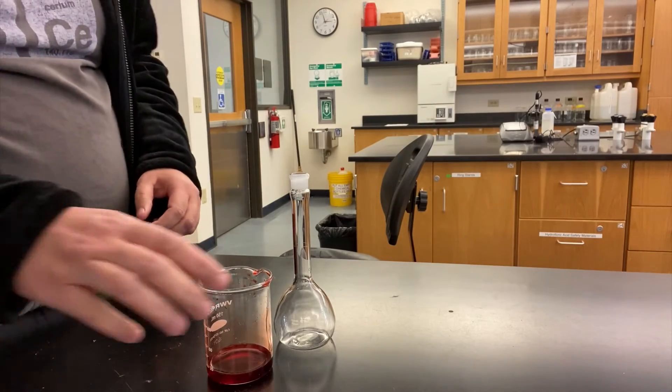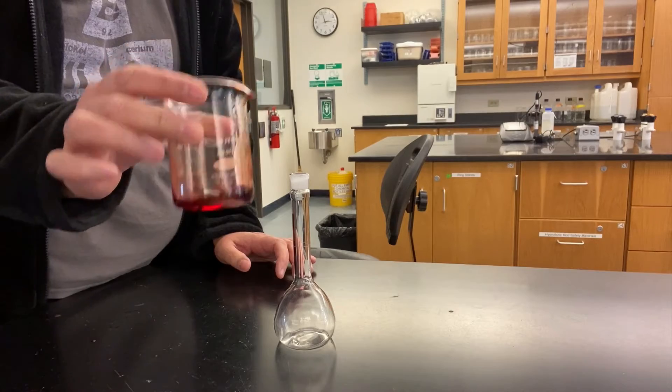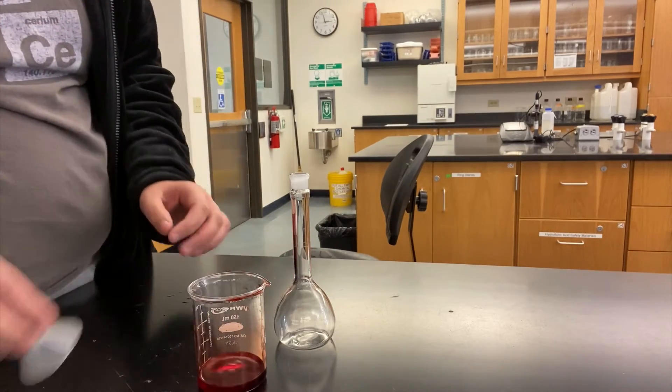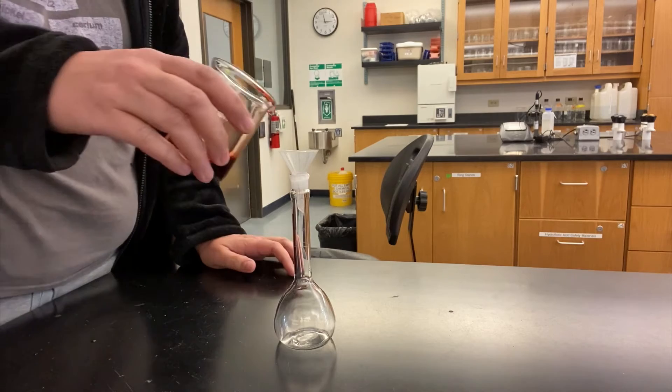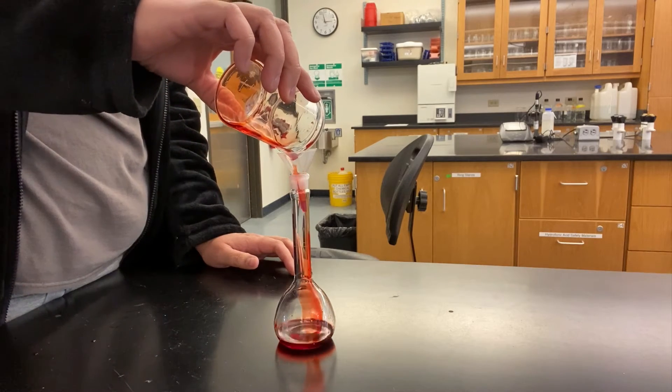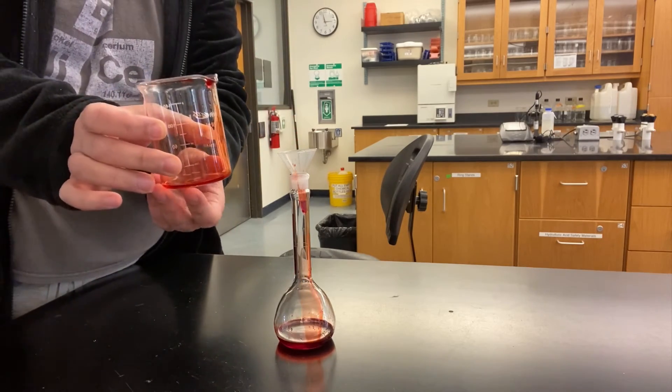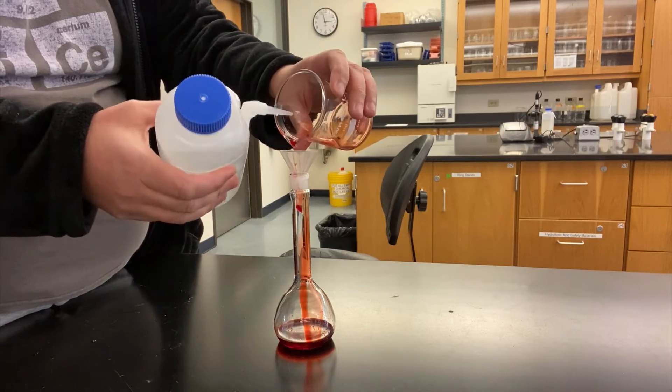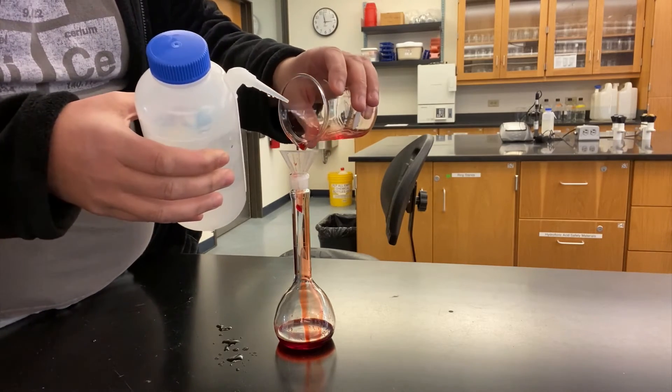What I've just showed you is just one technique that could be classified as quantitative transfer. Here are a couple more. In the previous example, we were transferring a solid to a volumetric flask, but sometimes you're doing a similar transfer with a liquid or solution. This sort of quantitative transfer works the same way. You'll first use a funnel to transfer as much of the solution into the volumetric flask as you can, then rinse down the beaker into the flask using a squirt bottle.